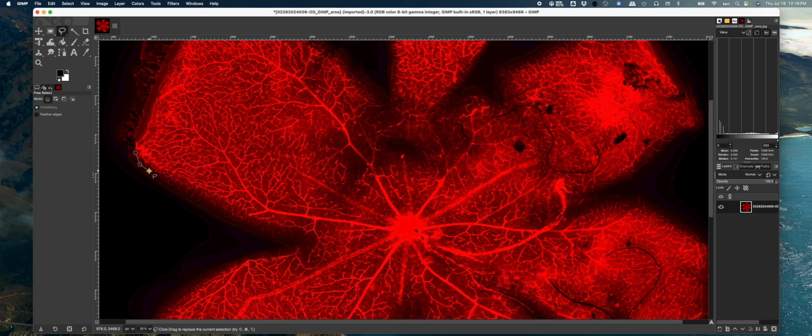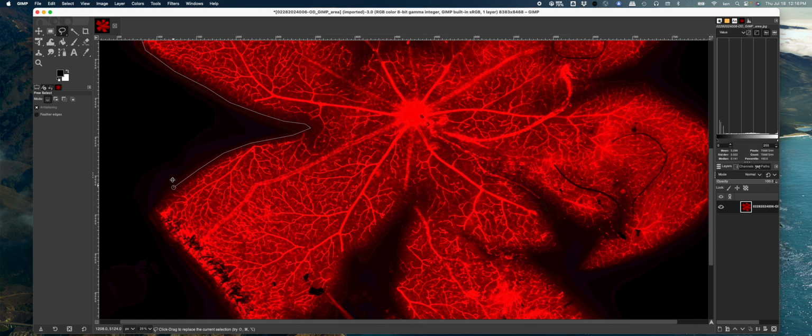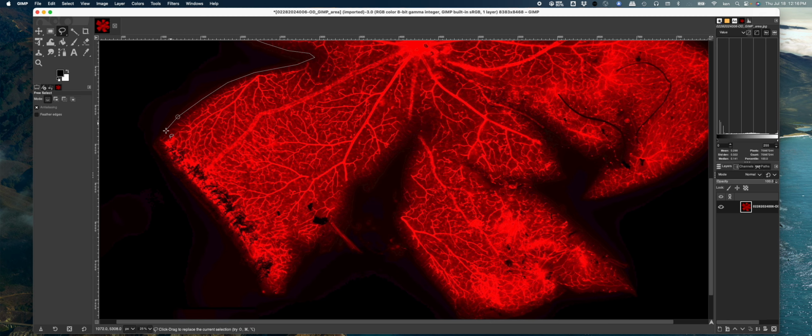I'm just going to keep clicking, and because I'm able to see where all the tissue and veins are, or all the capillary beds, I'm really using the edges of these capillary beds. I know they were ripped here by a cut, so that's really where the tissue is. Now I want to move this image. I'm going to hold down the space bar, and now I'm just going to move up the image and just continue on my way.